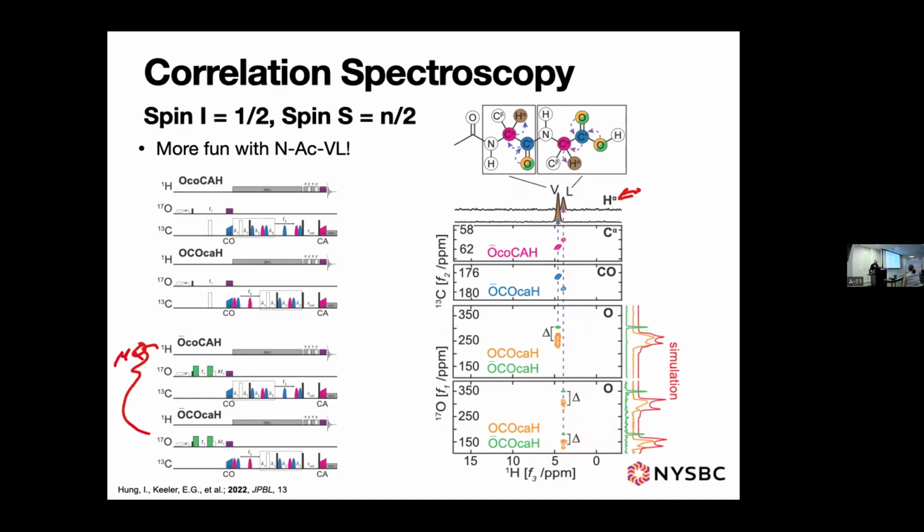The green is the multiple quantum detection, and the yellow is just your MAS, you're just doing MAS at the beginning. It's very satisfying and nicely laid out, so you can understand the story.